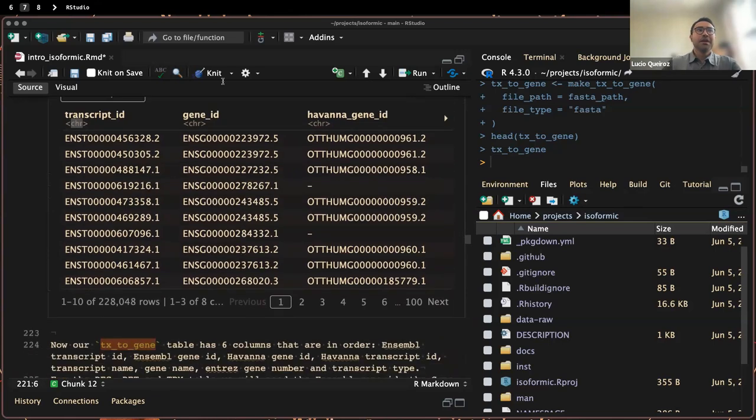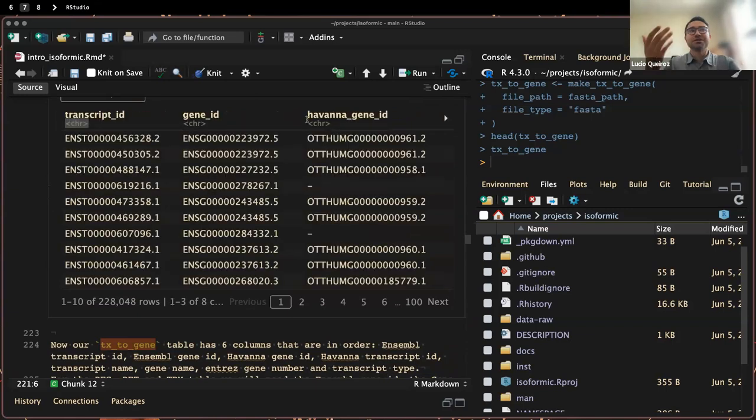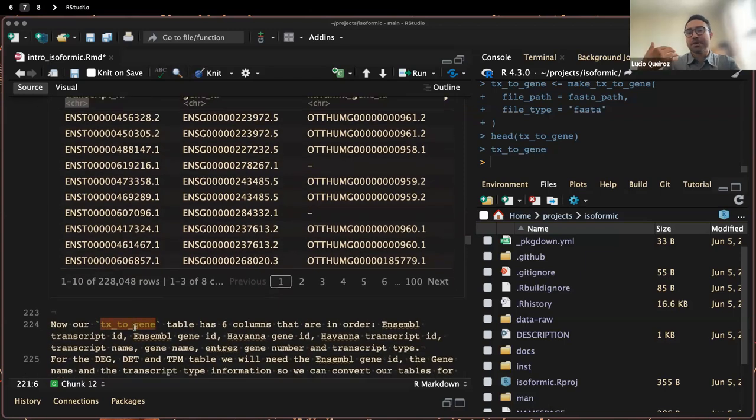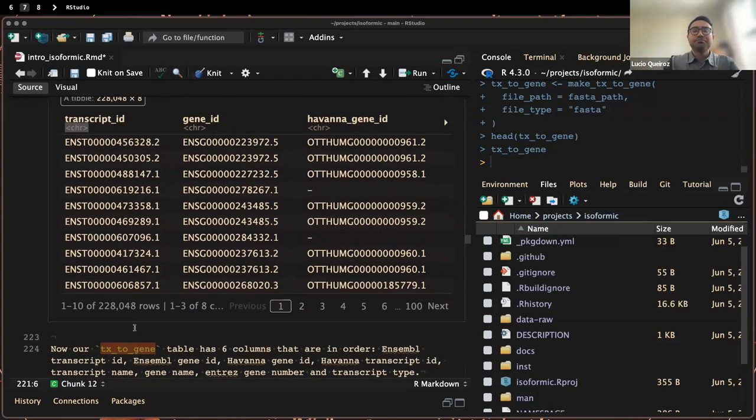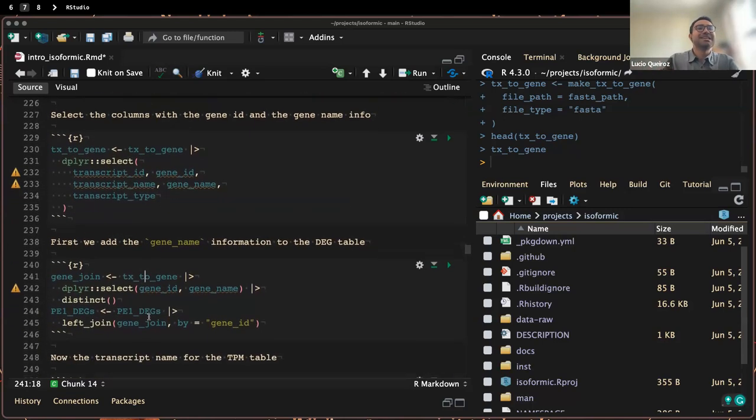And like I said, if you have a different annotation for those transcripts, you just need to change the table and include other genes, other regions of your interest. It can be adapted in the workflow. But yeah, GENCODE is the easiest to interpret right now, and I'm not saying that it's the best or that it's going to save humankind, but it's the one we can work on, at least in a streamlined way, without changing annotation, without integrating. We actually work with other annotations. We try to integrate annotations when we don't have information about specific genes. But yeah, that's the approach.